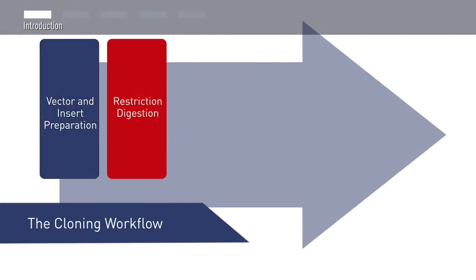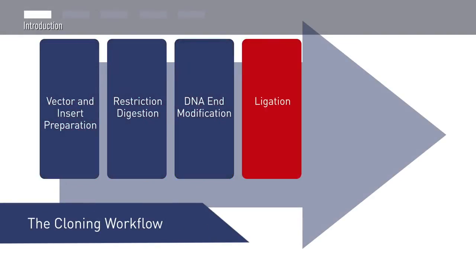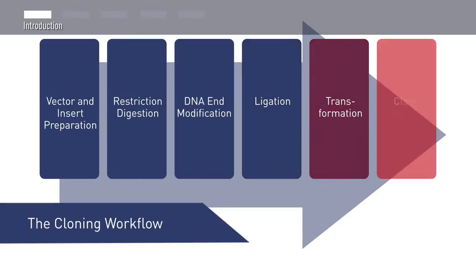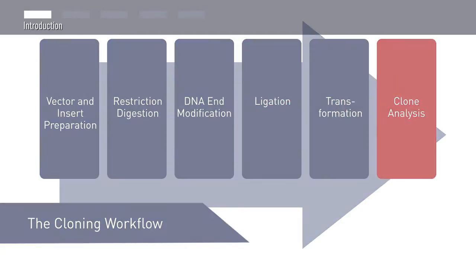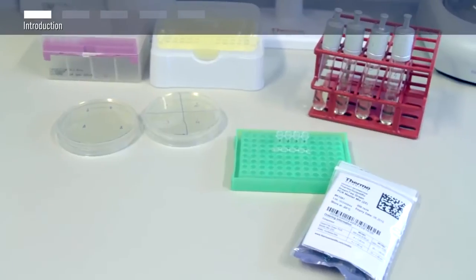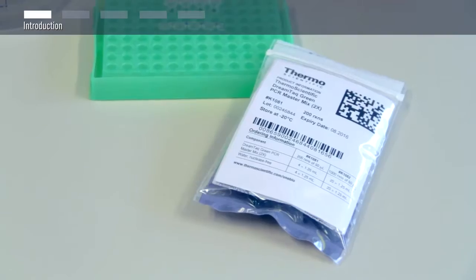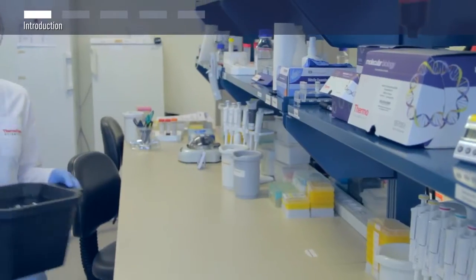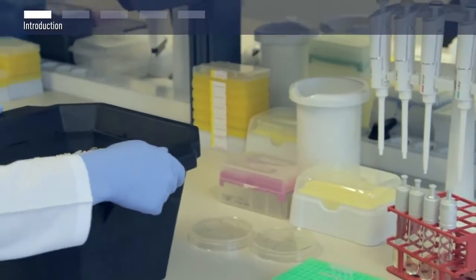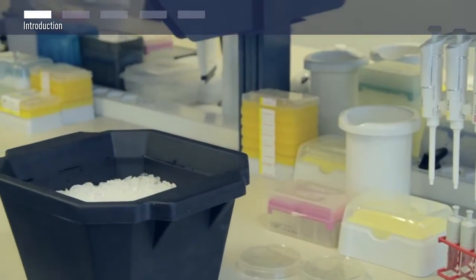Colony PCR is often used in the cloning workflow to analyze bacterial colonies for the presence of the DNA insert after ligation. In this video, we will show you how to do fast and simple Colony PCR with Thermo Scientific DreamTaq Green PCR Master Mix.